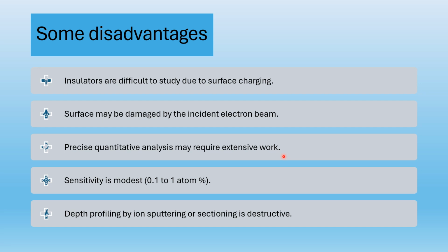It's a skilled work, so a person who is highly skilled and properly trained can only do the whole work. Sensitivity is modest, not so much. And also, the depth profiling by ion sputtering or sectioning is destructive sometimes.